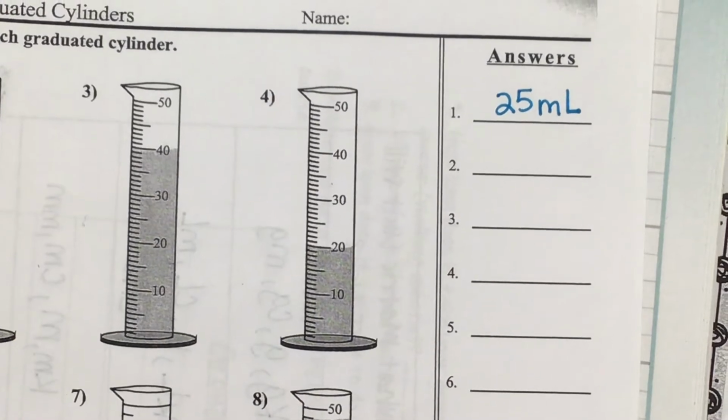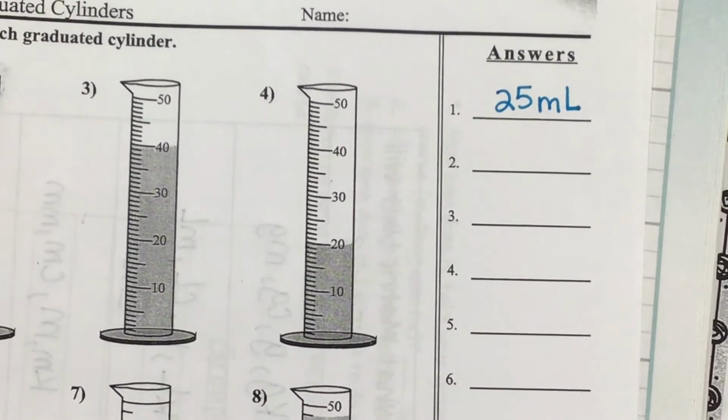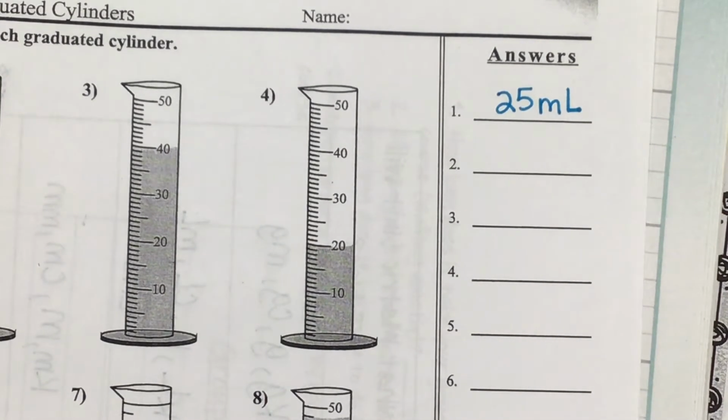Now, one thing about the graduated cylinders, which is true also for the balances, is you won't see it accurately unless you get down at eye level. Because of that meniscus, you won't see it accurately if you don't get at eye level. The same is also true. We don't want to shake the table. Okay? Okay, number 2. Let's look at it.